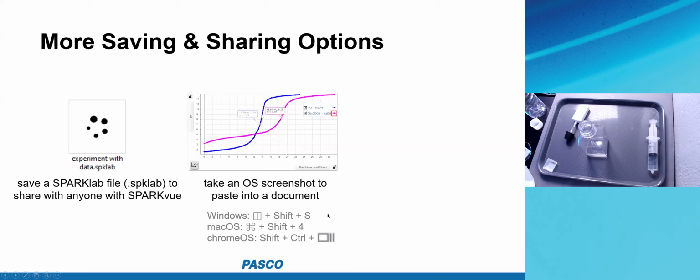So I would recommend, if I was still in the classroom, I would have students do screenshots of their analyzed data and drop it in a Google Doc, or in their Google Doc version of their lab write-up that you would get from the lab manual. That's what I would do. If I was in the classroom, you have whatever works for you.